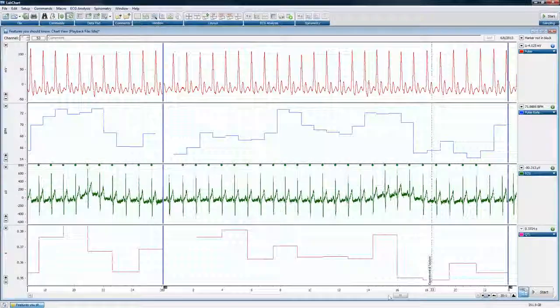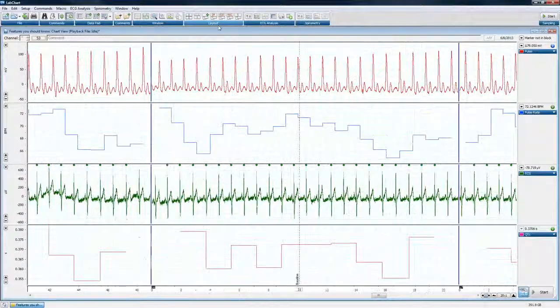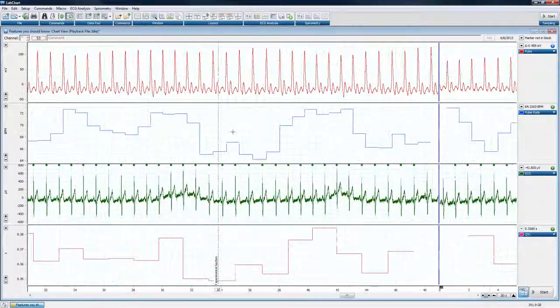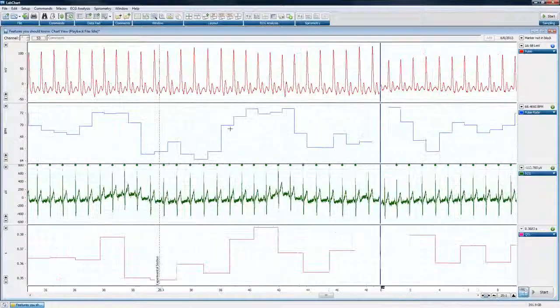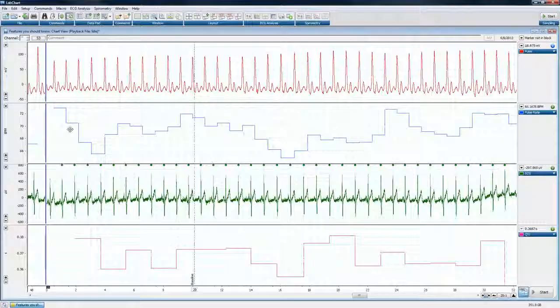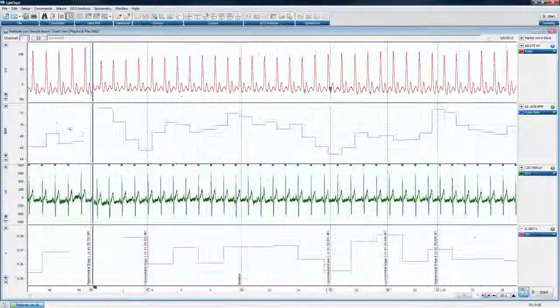Instead of trying to simply use the scroll bar down at the bottom, you can have it do it by itself, so you can just watch and not worry about how fast you're moving things. And you can move it at the right speed that allows you to see everything happening. Okay? And it won't stop until you click on the chart view again. If I click on the chart view here, it'll stop, which is great. And the faster you do that, scroll, hold control, click, scroll, and let go, the faster the data will move.